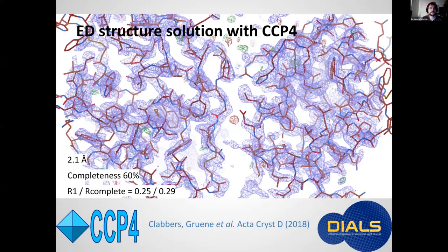So after data processing of that case, we solved the structure by molecular placement with standard CCP4 tools, using the keywords for electron scattering in phaser and REFMAC. And here we get a view of 2.1 angstrom electrostatic potential map. It doesn't look so different from electron density maps really at that resolution. The overall completeness of this data set is only 60%, but that's largely because of the limited tilt range in the microscope, which was about 40 degrees.